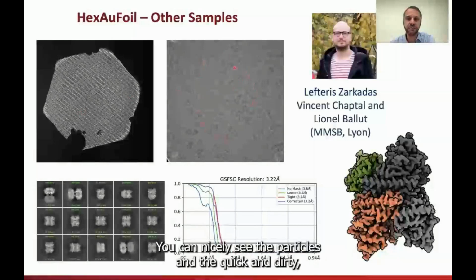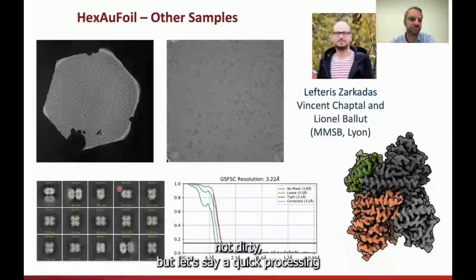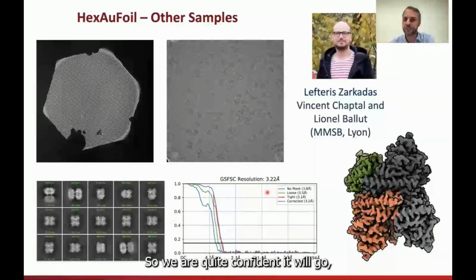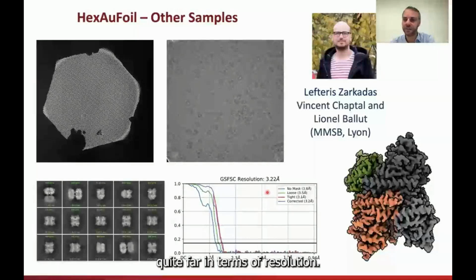That's a typical image. You can nicely see the particles, and a quick processing of only a small part of the images already led to a 3-angstrom resolution map. So we are quite confident it will go quite far in terms of resolution.